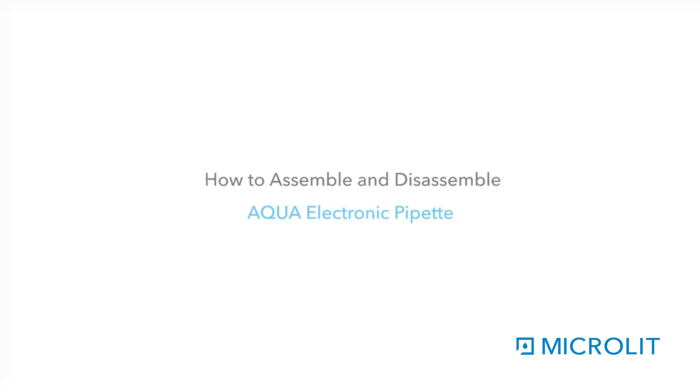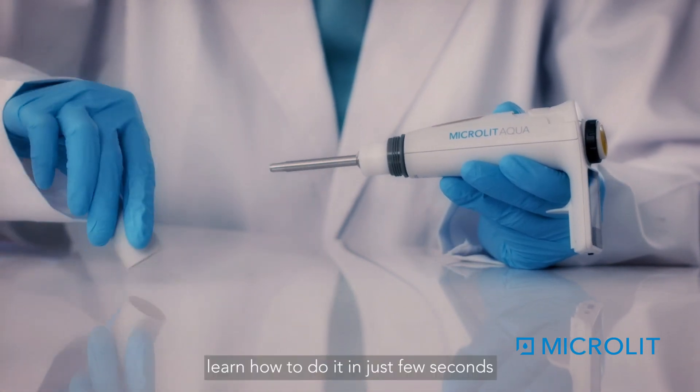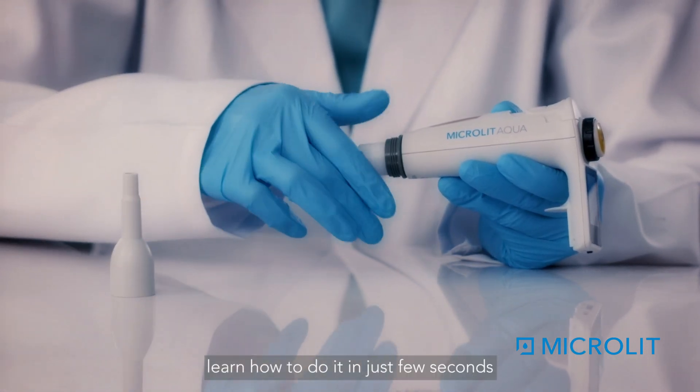How to assemble and disassemble the Aqua Electronic Pipette. It is very easy to assemble and disassemble, and one can learn how to do it in just a few seconds.